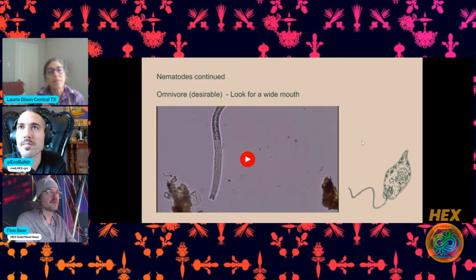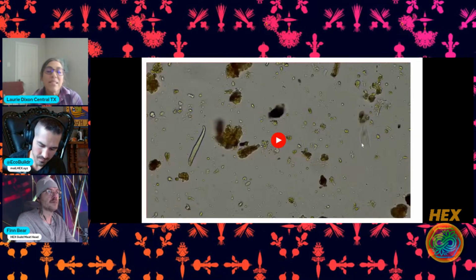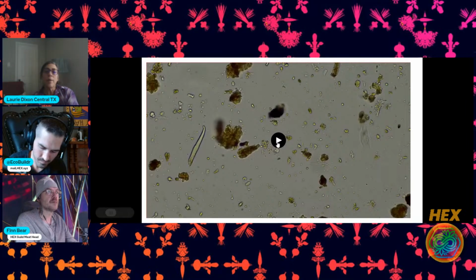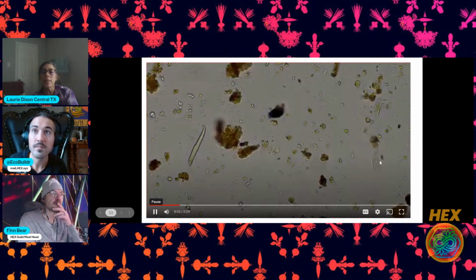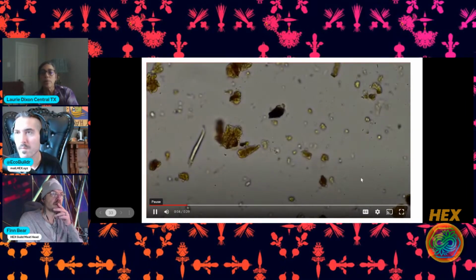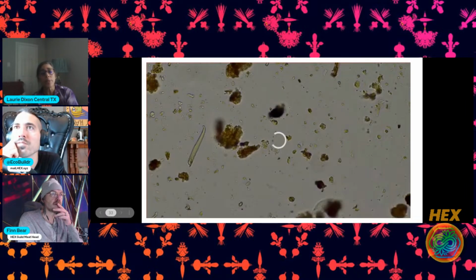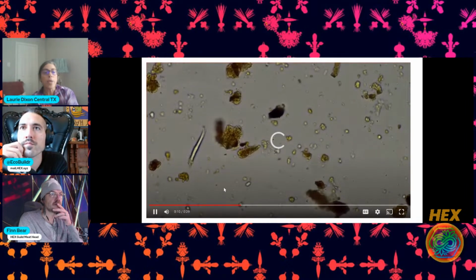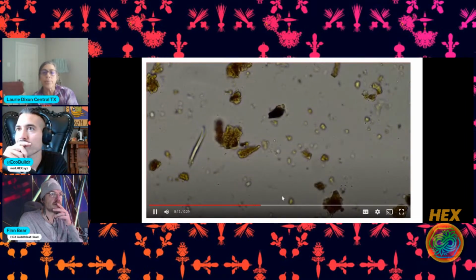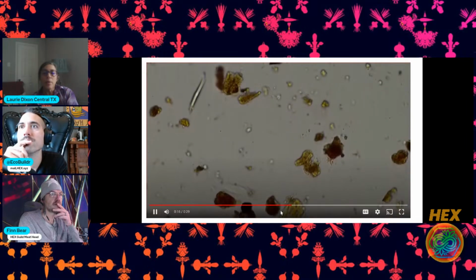Let's go on. So now we're into some of the videos. And I'll just kind of talk through what we're looking at. This is a ciliate. He's very large. They're super fast. So when you're looking at them under the microscope, sometimes you'll just see a shadow zoom across, and you know that you probably got a ciliate in your sample. But this guy is going to come back up, I think. There he goes. They're really hard to follow.